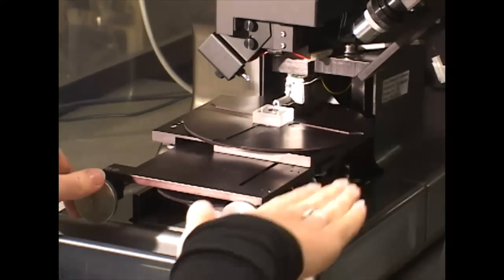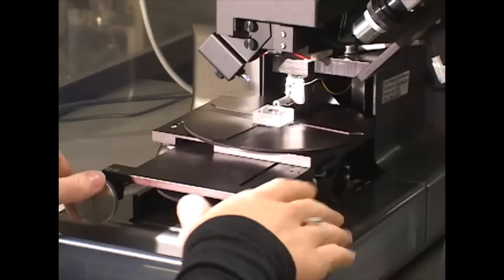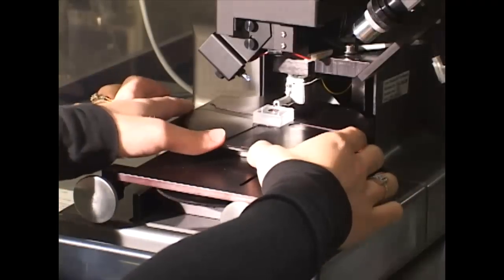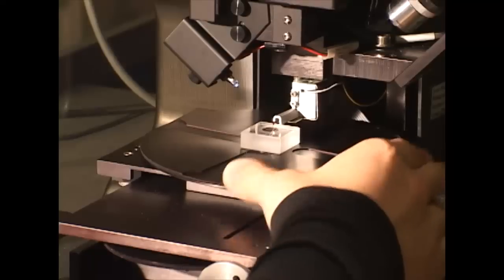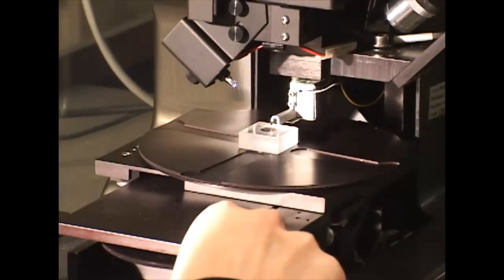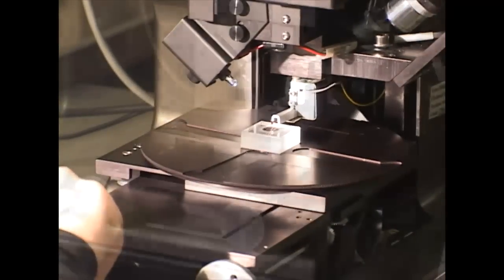These two knobs move the stage back and forth, front to back. And then this dial actually rotates the stage in a circle. So we'll rotate the sample, get it in correct position for the measurement. We'll close the chamber and go back to the program.